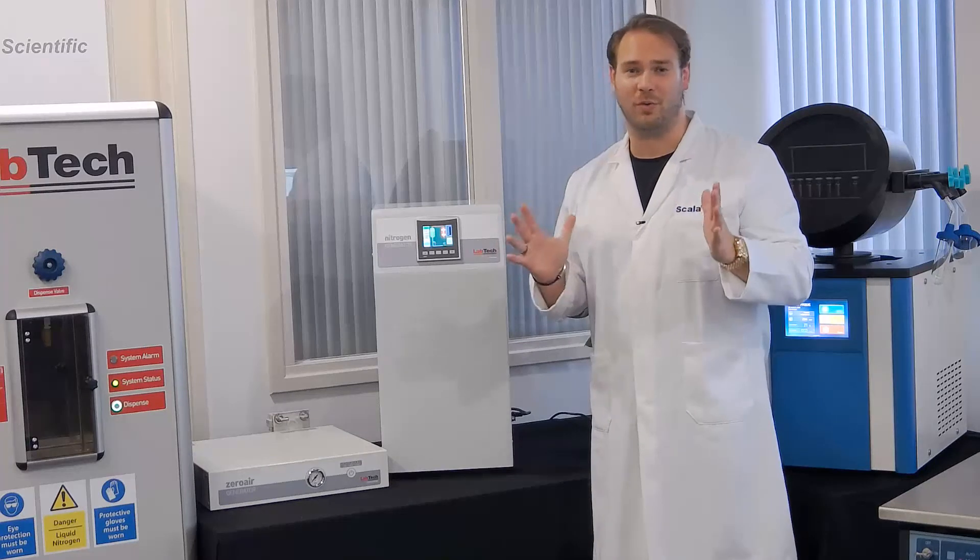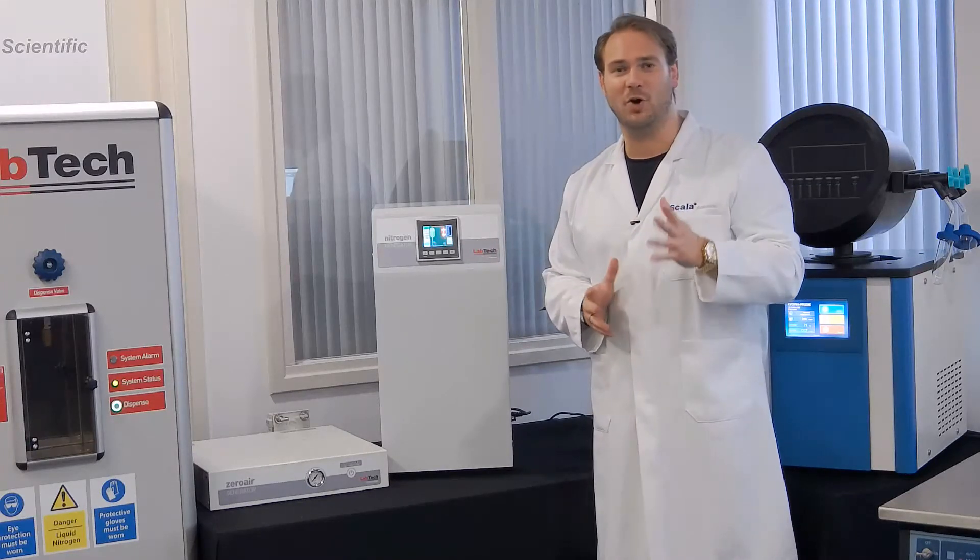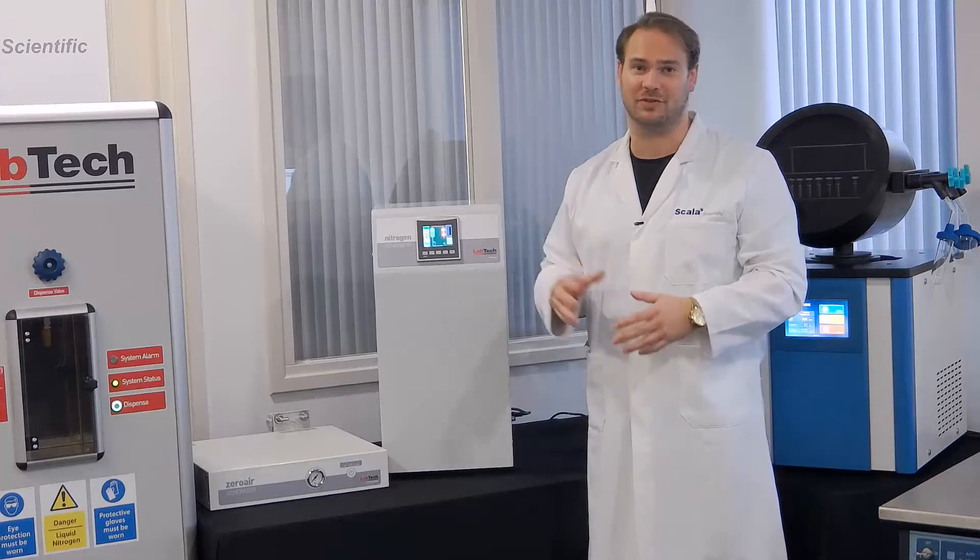So, no more running out of nitrogen, and no more dangerous and inconvenient transport with your nitrogen bottles.